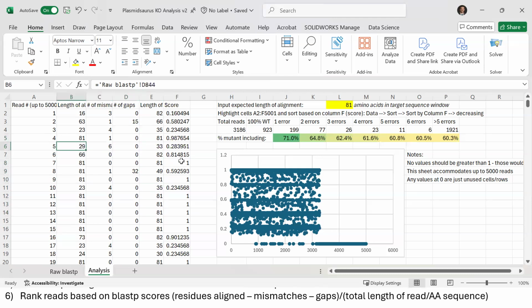And I do want to caution you here, one thing we're not controlling against is you see how the total length's only 33? So this is going to show up as a pretty bad mutant, but really, it's only a few bases longer than that alignment. So this could be a truncated read. All right. So we do want to be wary of any of those types of situations. Okay. And we might actually want to eliminate reads that are below a certain threshold. Okay. Because they're too short to even detect some of these Cas9 mutant sites.